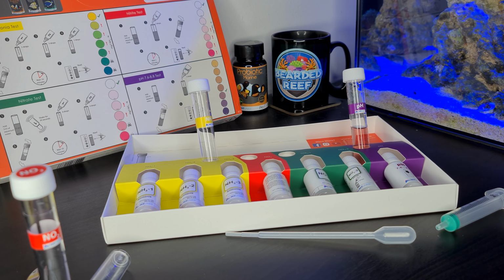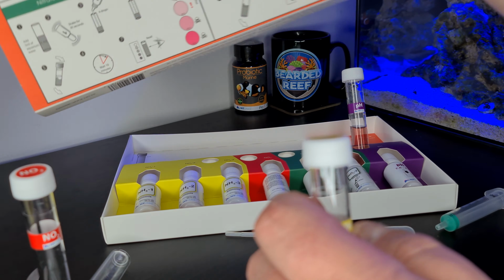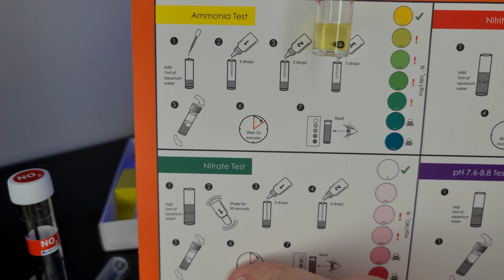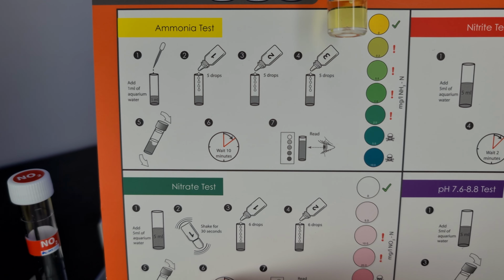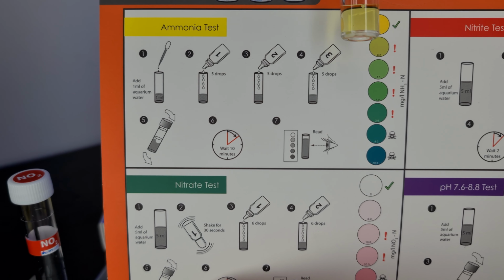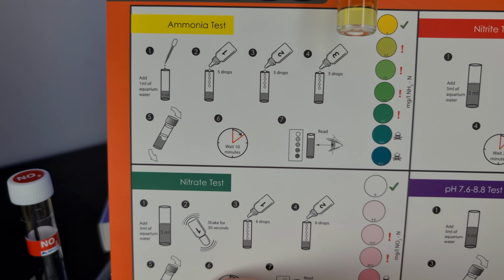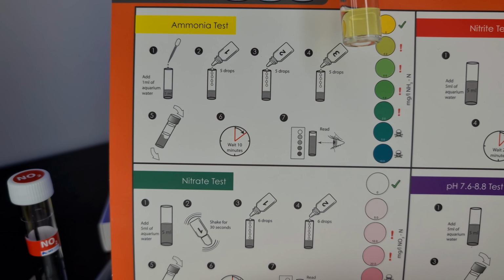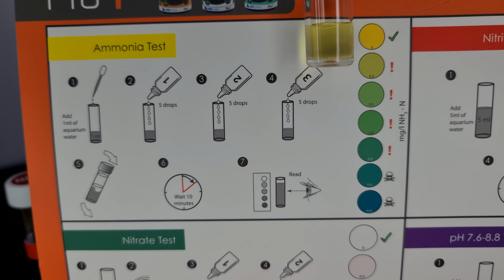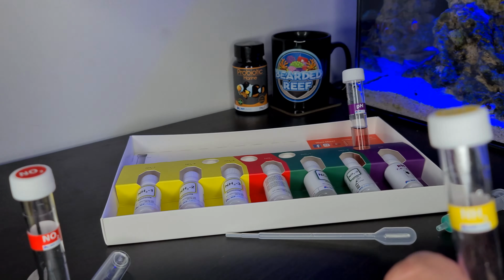Okay, so after what felt like an eternity, that's 10 minutes up. So have a look at this here. As you can see, it's a kind of yellow colour, so compare this against the chart. I don't know how you can see that there, but I'll hold that away. It was definitely more yellow than the kind of greeny colour. So the next one down there is 0.2, the yellow is 0, so I reckon there would be 0.1 on the ammonia. It could be 0 to be fair. I think it's 0.1, I would say.